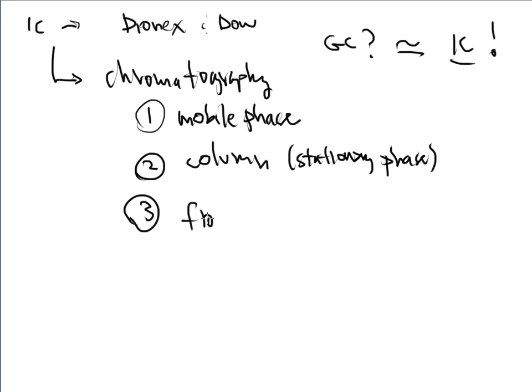We're going to also have to talk about flow rates. That's also something that's pretty important. We saw that really take part in gas chromatography, where we would go in and set flow rates of the helium gas that was coming through our system. The same thing's going to happen in ion chromatography. We have to talk about proper flow rates. We don't want to go too low. If so, we're not going to get a very good chromatogram. And we also don't want to go too high, because if we do, it's going to increase the pressure and things are going to start popping. So those are going to be problems for us, and we need to watch out for them, and we need to talk about flow rates because of that.